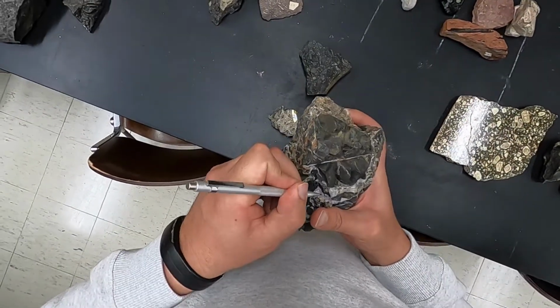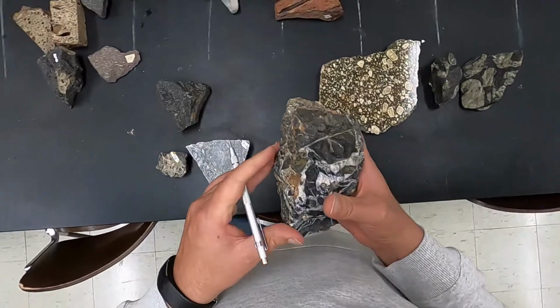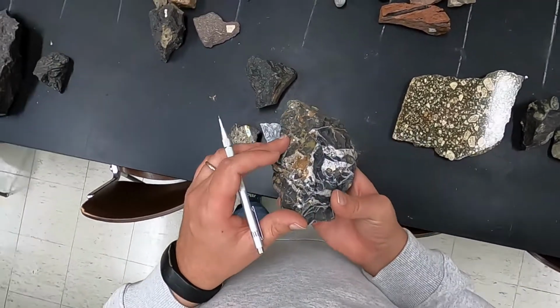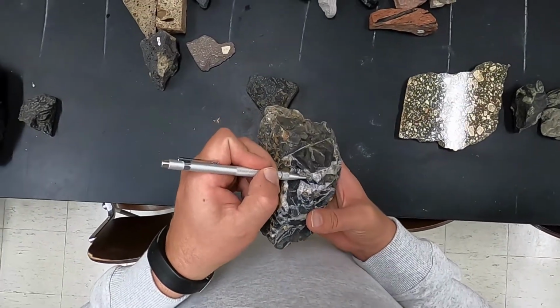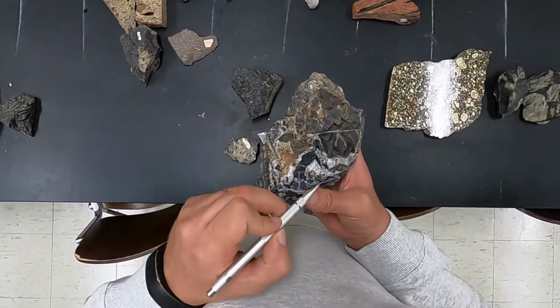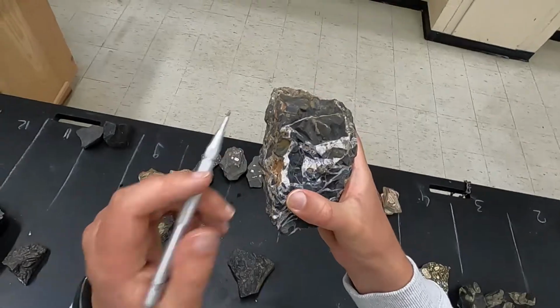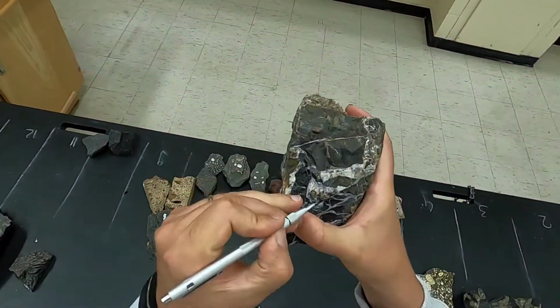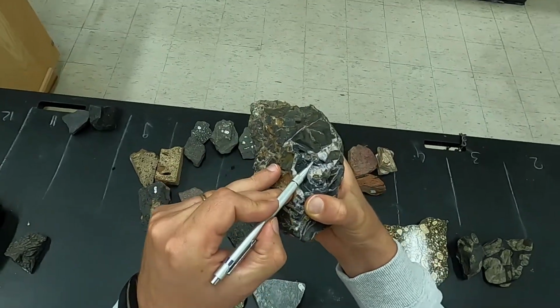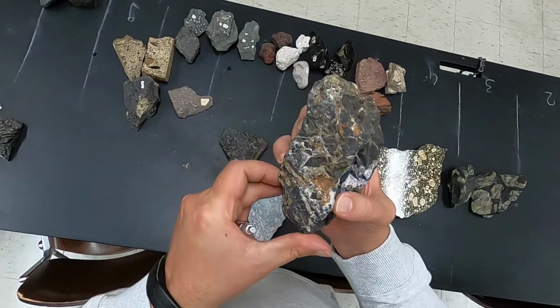It's really too strong. It's even hard with the steel file to actually scratch it. And then I have some sulfides as well present. This is submetallic honey-colored sulfides. So most likely these are crystals of sphalerite. So you can see here this characteristic honey color, which is an indication of the fact that this sphalerite is present.